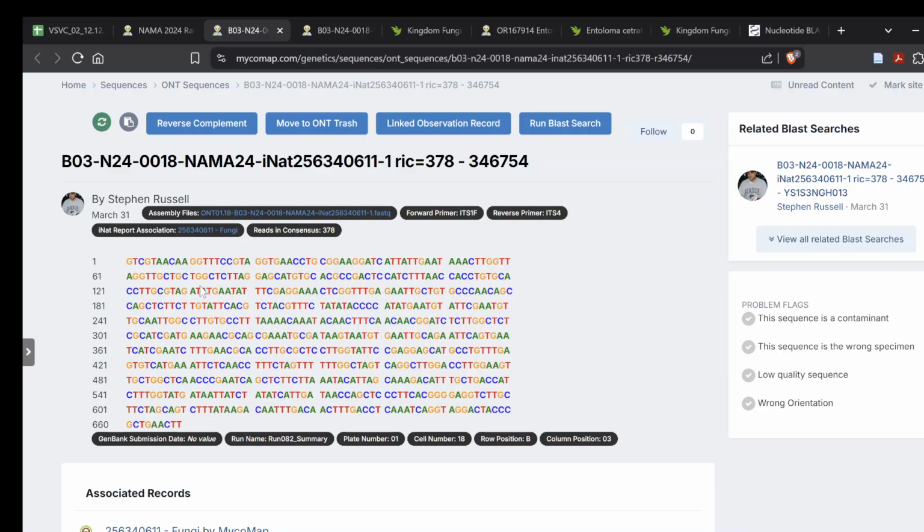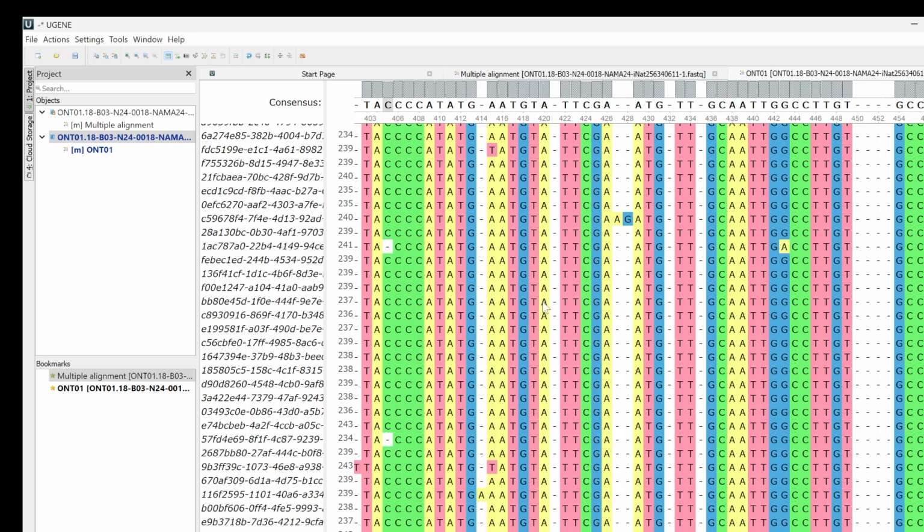However, the computer's a little dumb, and it makes some assumptions that I don't like to make. So I generally will recommend doing a manual alignment so that you can correct any mistakes that the computer made. Once you get really comfortable, maybe you can skip it in some cases when you're really confident in the data, but until then, I recommend doing it with pretty much everything.